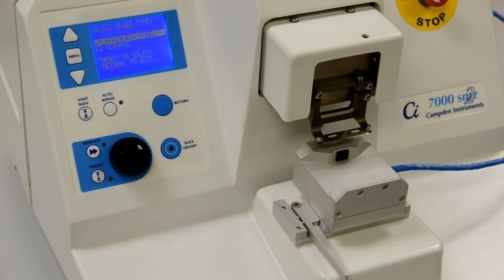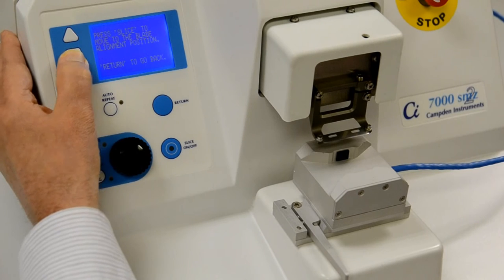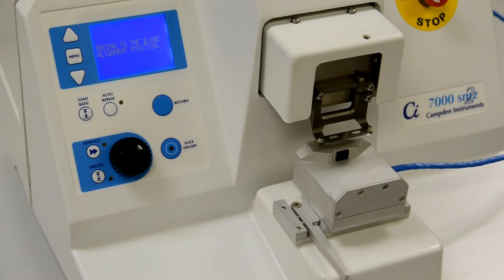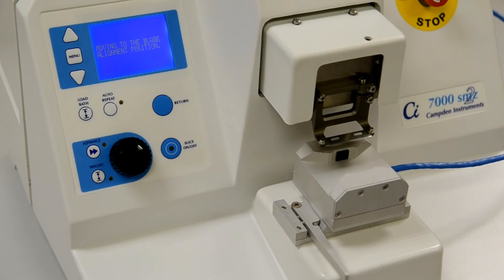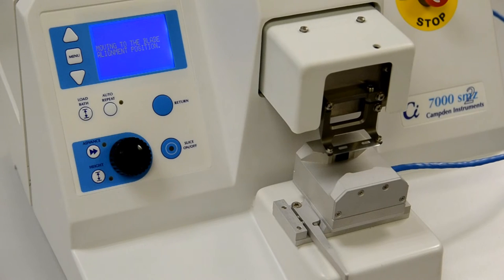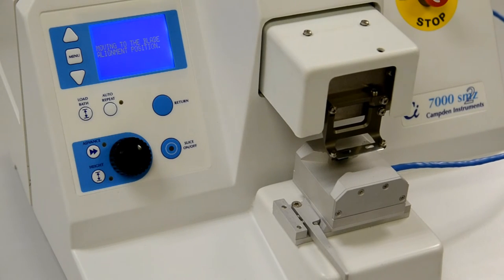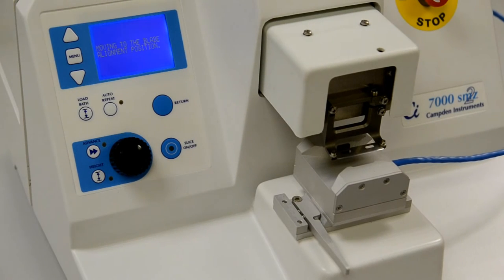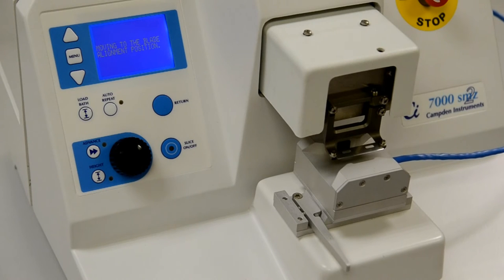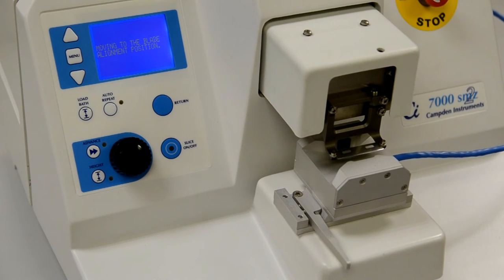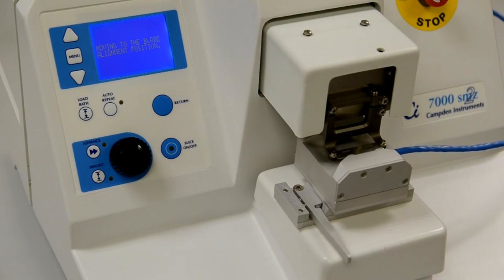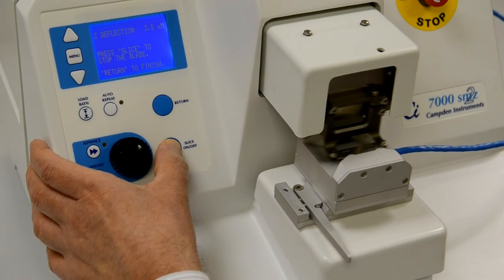Confirm that it has been fitted and confirm the type of blade. The instrument will now reposition the blade edge relative to the optical unit and ask you to press the slice on-off key to initiate blade vibration. The current blade alignment error will now be displayed, so press the slice on-off key again to stop the vibration.